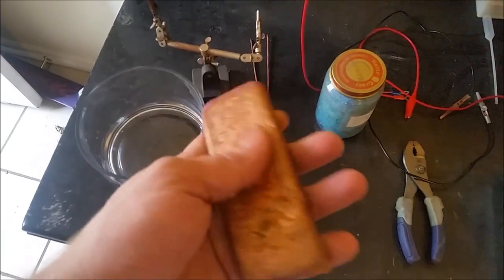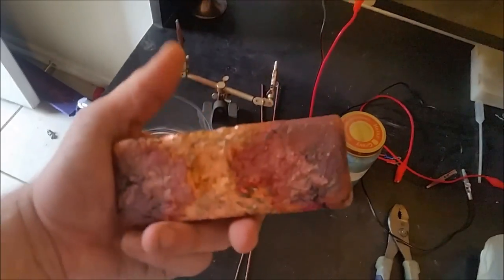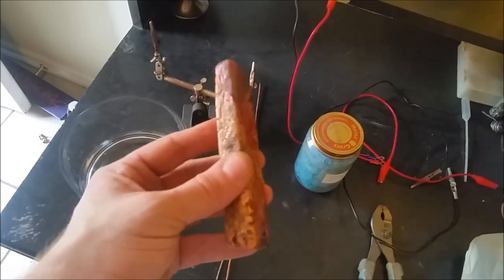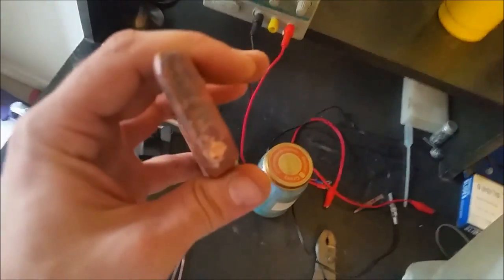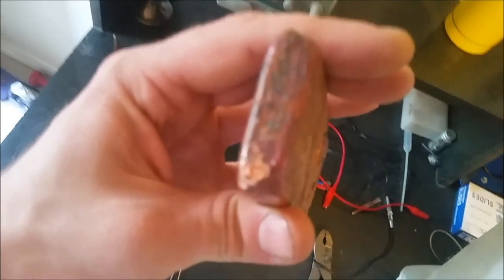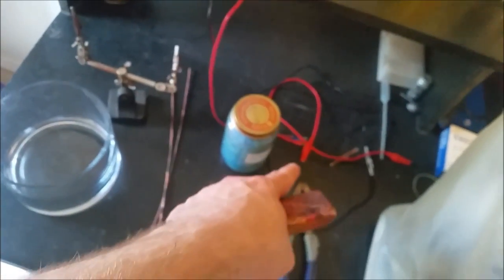This is an anode that I had poured. This is just made from scrap copper — pipe, wire, things like that. I just crushed it all, threw it into a crucible, and melted it into a little rectangle mold. I drilled a little hole at the top here so I can clip the alligator clip onto it whenever it goes into solution.